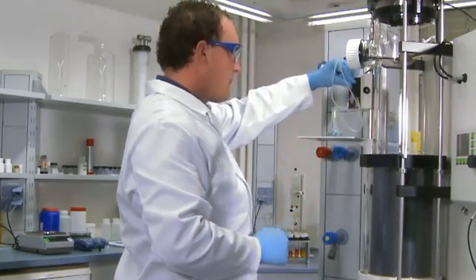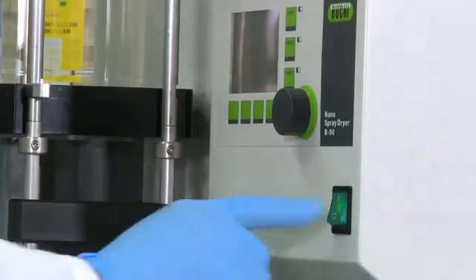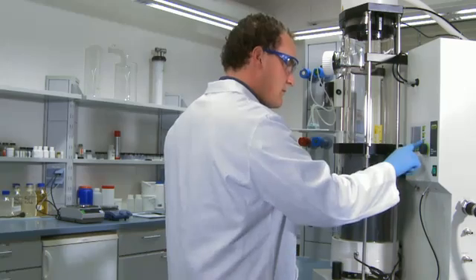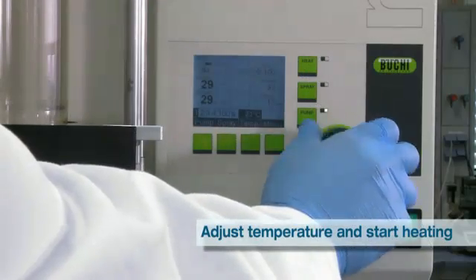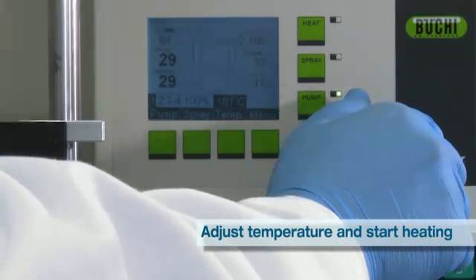Then close the peristaltic pump and turn on the instrument. Adjust the spray gas flow. Adjust the temperature by pressing the temp button and turning the knob. Turn on the heater by pressing the heat button.